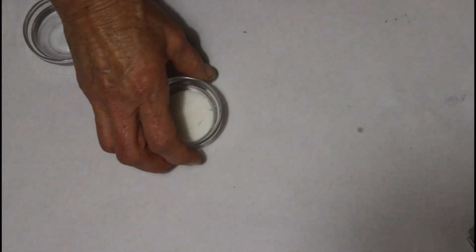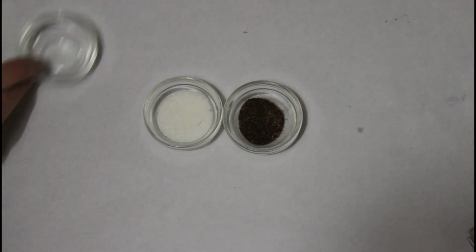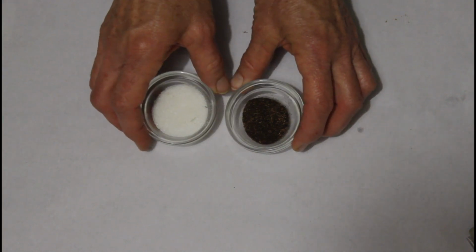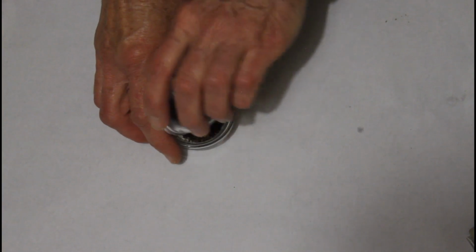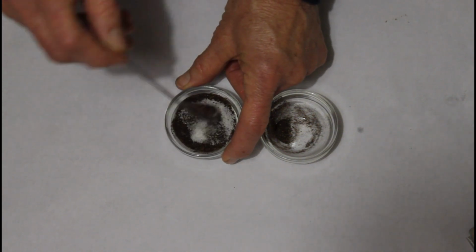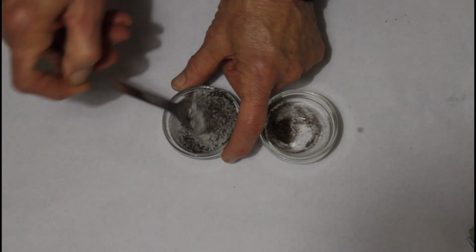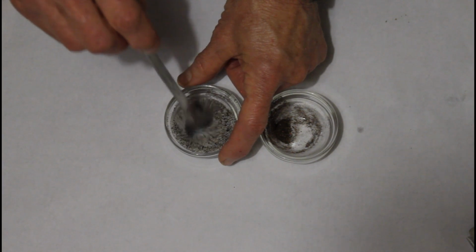Let's go to something a little finer. I have some sugar and I have some tea. If we look at the tea, number 3, it says we must mix the two together. So I'm going to mix the tea with the sugar. The tea came out of a tea bag. I'm just going to mix it quickly with this spatula, or a scientific spoon. We can call them any of those names.